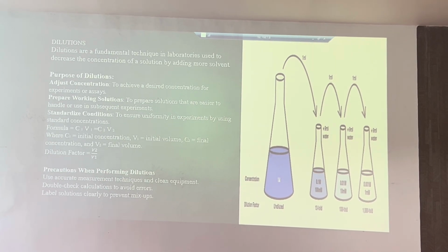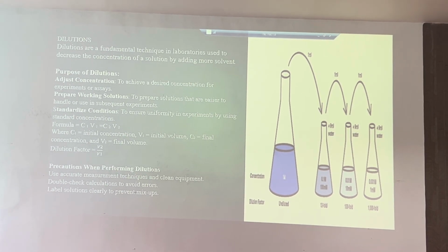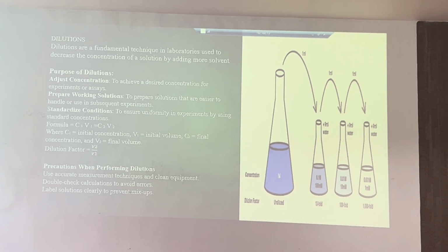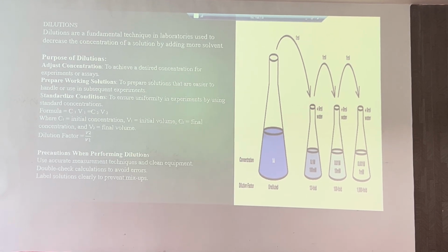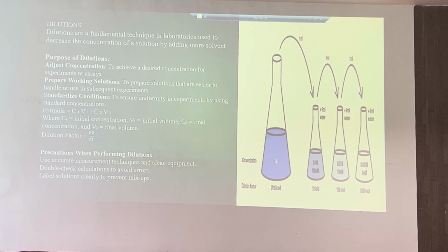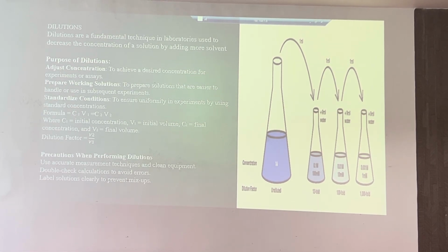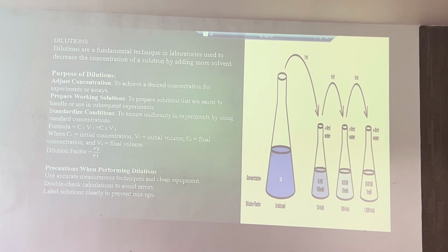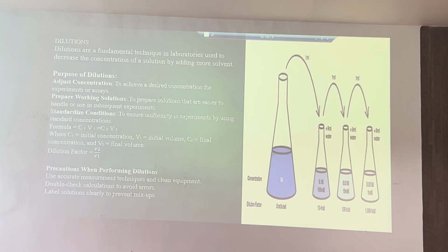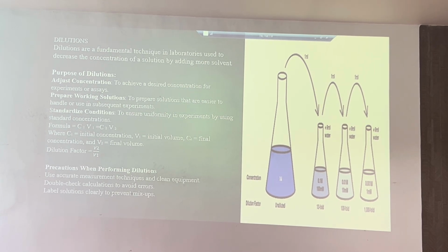What will happen? He does all the dilutions, he will mismatch the stock with the final dilution, then he will inject it and get a higher result. It leads to OOS. And second, always use dry glassware, especially when you are doing an assay test. There should not be any wet particles or wet substances, because if you are weighing 20 mg or 15 mg of the API substance into the volumetric flask and it is stuck to the walls, it may lead to uneven, inconsistent results.